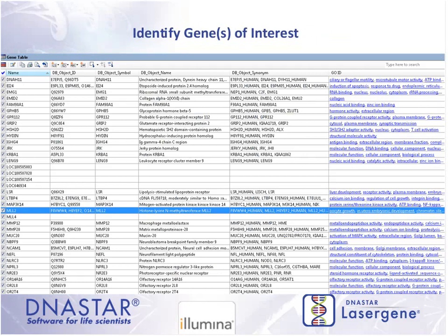So here's a gene table for this particular experiment. This MLL2 gene was of particular interest, and it drops out. It was in our intersection along with some other potentially interesting genes. The table is populated in this case with GO Consortium terms. These are all links. These are GO ID terms.